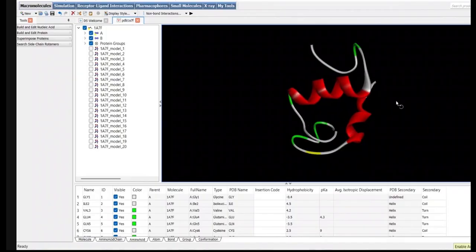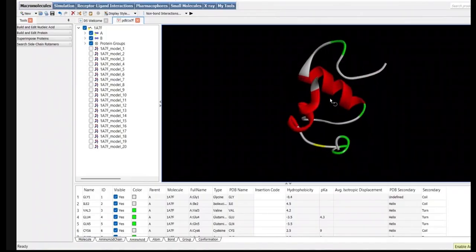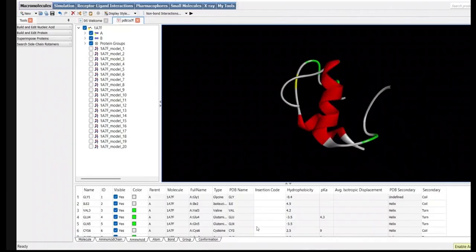And if you want to see the interaction of this one with another, let's say protein, then those force fields will change, the bonds will change, right? Those things are done in the MD simulation. So yeah, that's pretty much it about the RCSB as well.